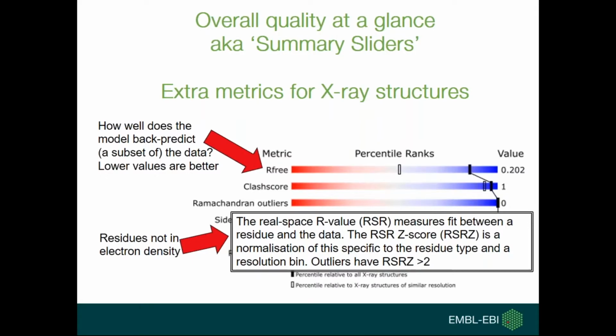And a residue is flagged as an outlier if the RSRZ is greater than a value of 2.